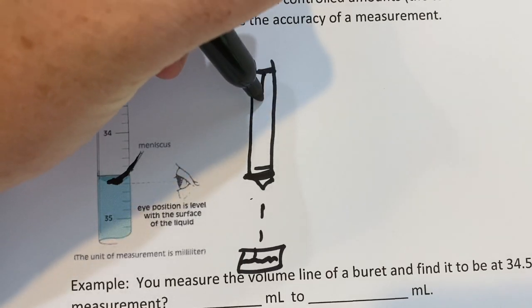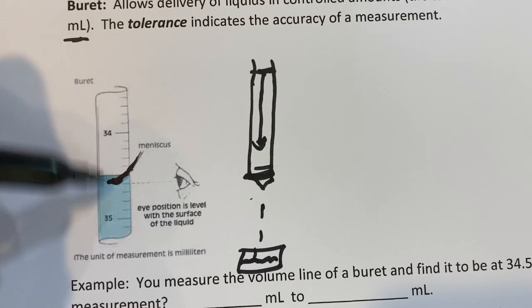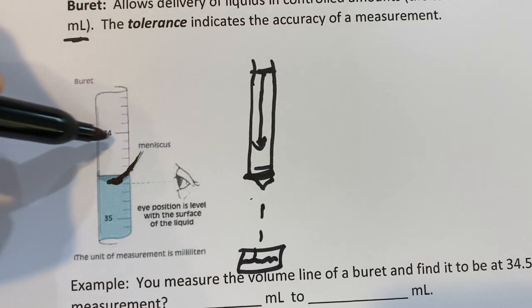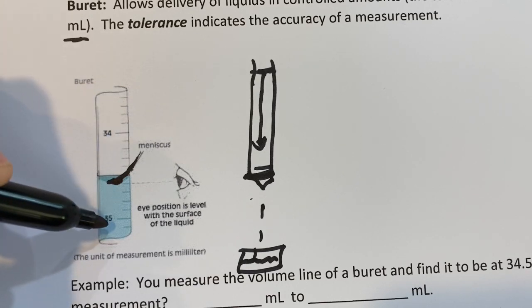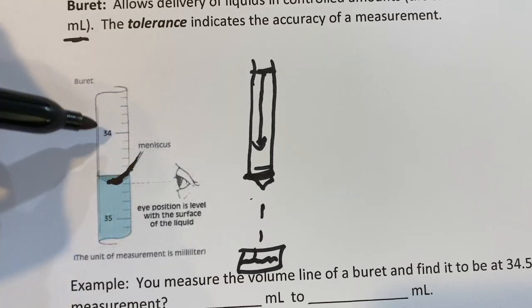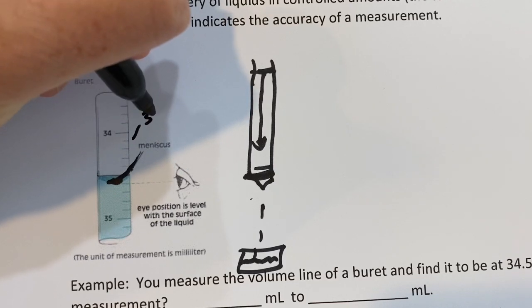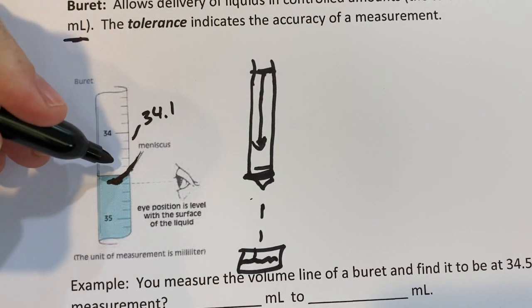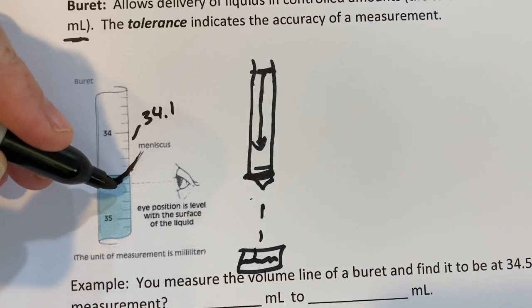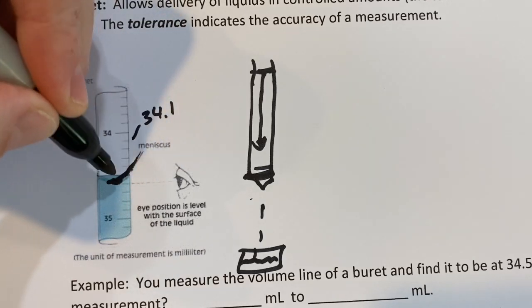And so the volume level is just going to continue to go down. So that's why when we're looking over here, the volume level's going down. In other words, here you would have delivered 34 milliliters, but right here you would have delivered 35 milliliters. And these graduation marks are between 34 and 35. And there's 9 of them, which tells me this is 34.1, 34.2, 0.3, 0.4, 0.5, 0.6. And it looks to me that this line is really, really close to 0.6, but not quite there.